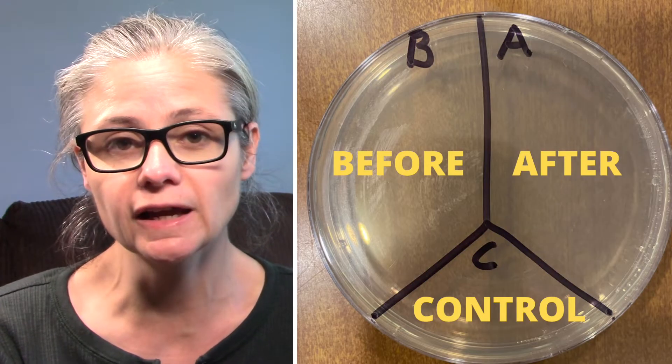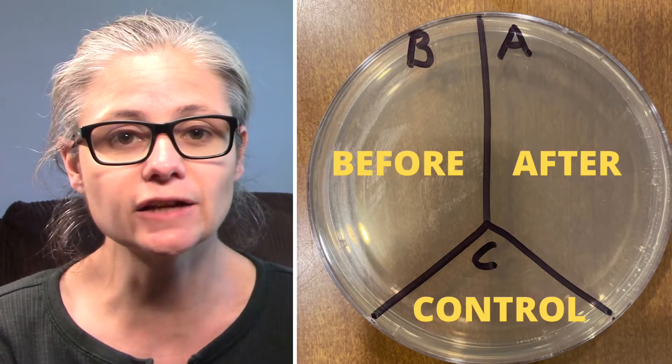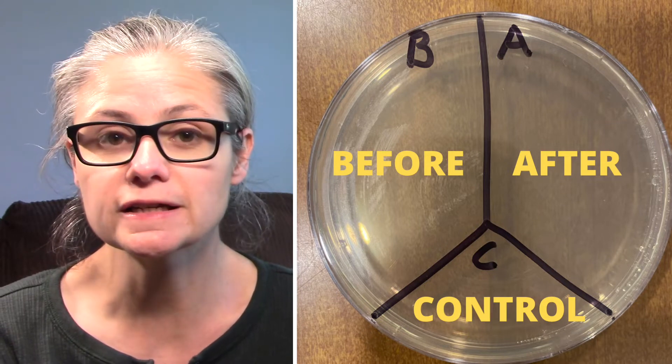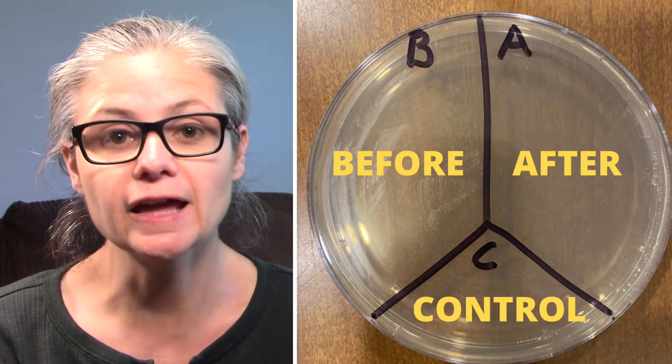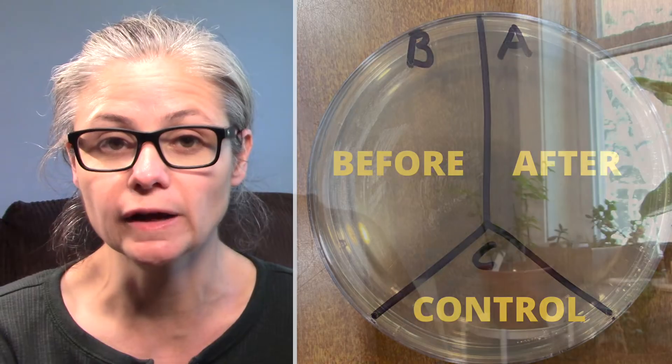Then I'll spray the area with the 91% alcohol and let it sit for five minutes. Then I'll swab the area again and place that sample on A for after. As a control, nothing is going to go on C. Let's see how well 91% isopropyl alcohol disinfects my home.